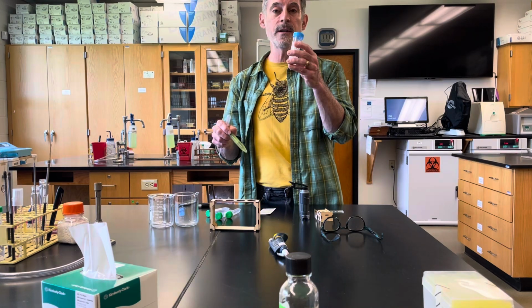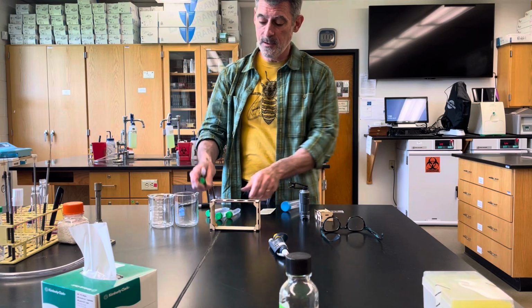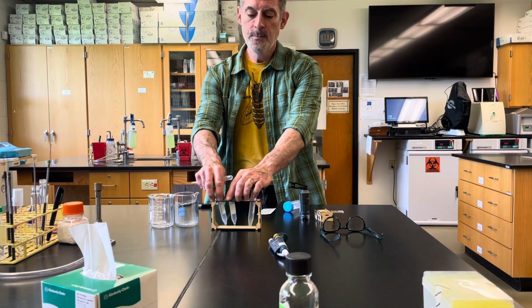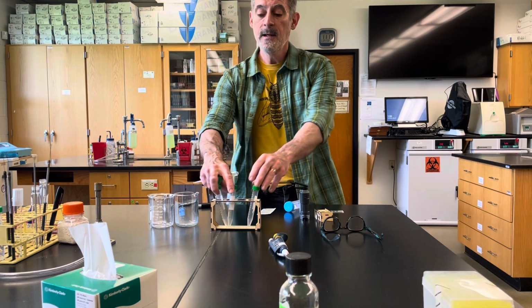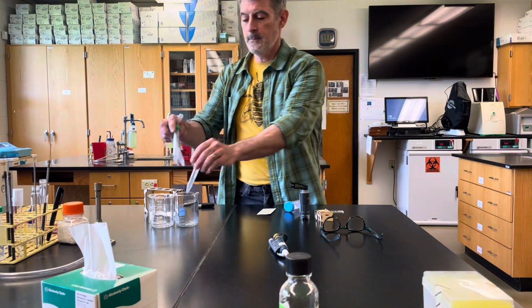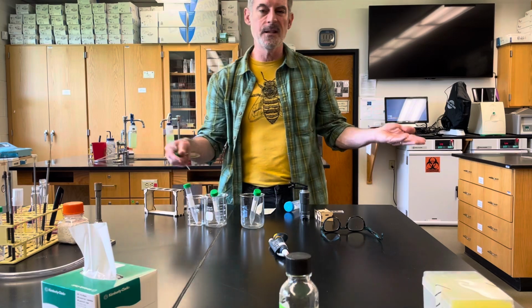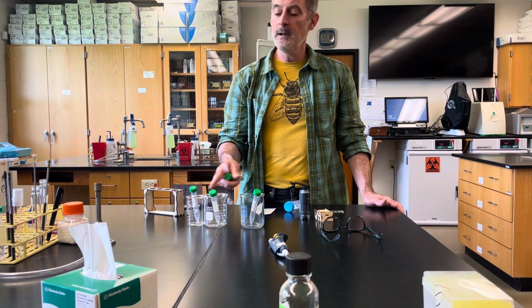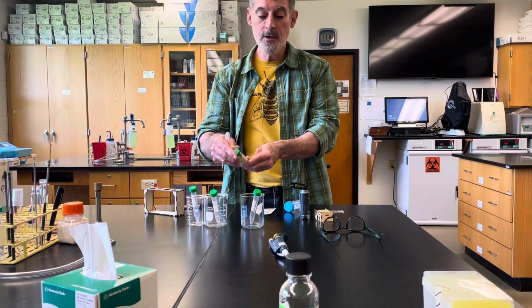With the experiment, you're also going to have a container full of seawater, and what you'll do is you will get 3 tubes. Now, if you're in one of the sections, you're going to get a little rack like this one. If you're in the other, you're not going to get the rack. So you're going to have to put them in little containers like this. So just any kind of little bottle, cup, whatever, you can just hold your tubes in. It doesn't really matter. Okay, so you have your tubes.